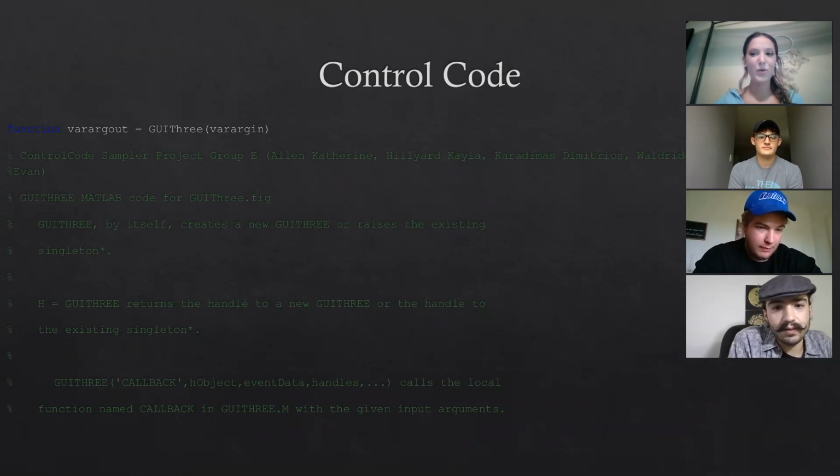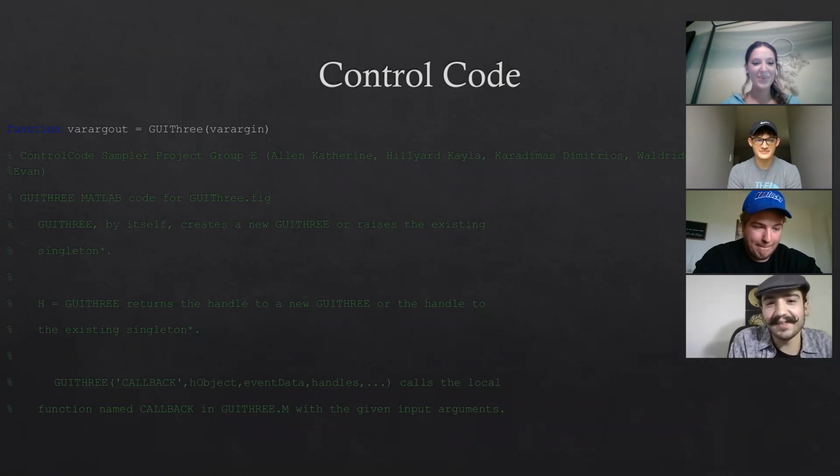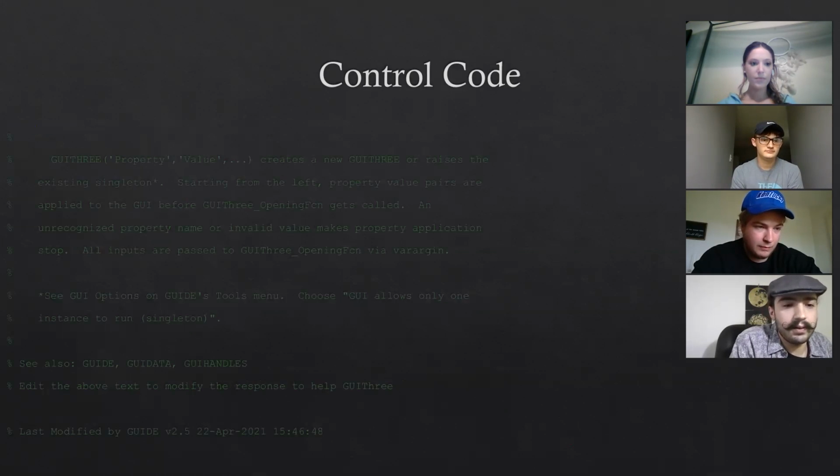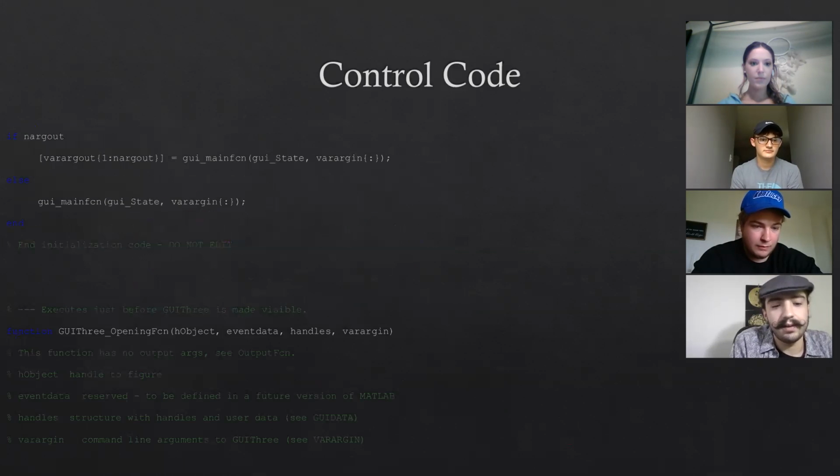This is the control code, but I'm not going to have you read through it. I'm just going to say generally that once the GUI, the graphical user interface, was created through the help of GUIDE, a program on MATLAB, it provided a general template. From there on, I proceeded to write the code with comments on what each part operates on. You can continue after this.